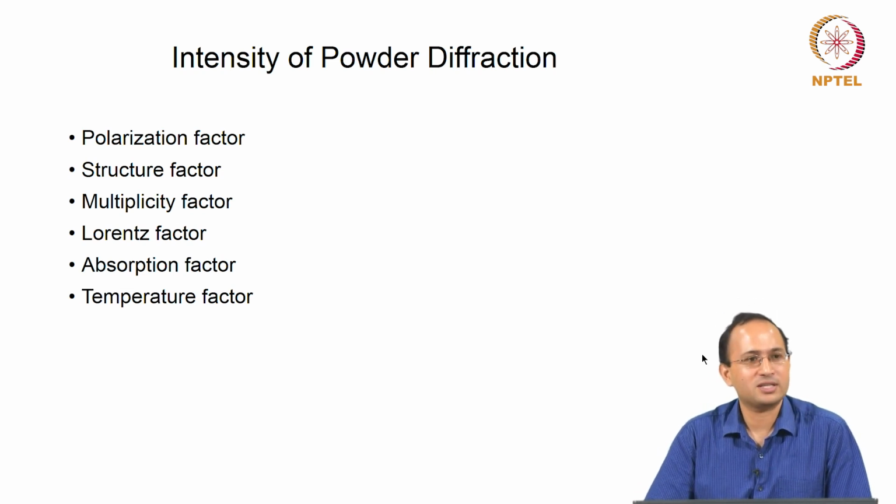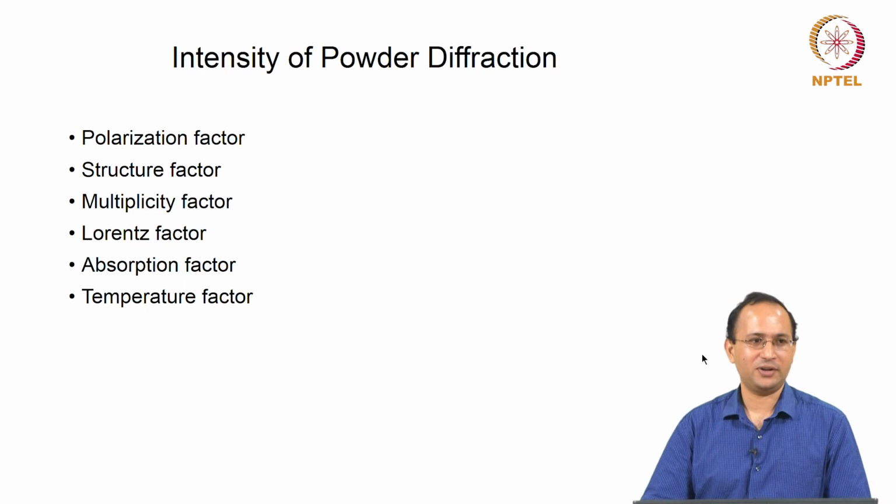Then we talked about the basics of crystallography. We did not go into detail, but covered basics like the lattice, the unit cell, different crystal systems, and space groups. Then we talked about diffraction. What is diffraction?